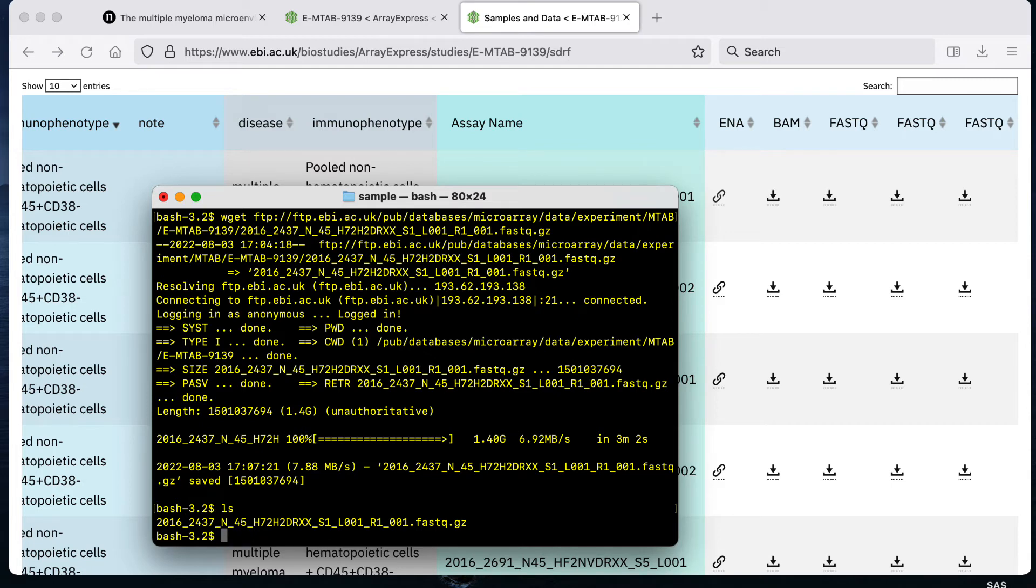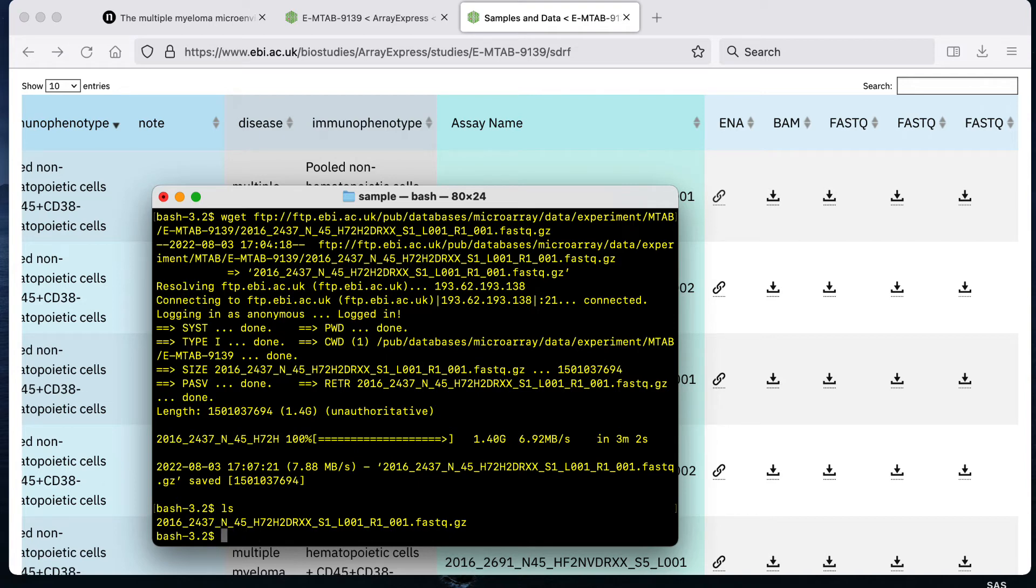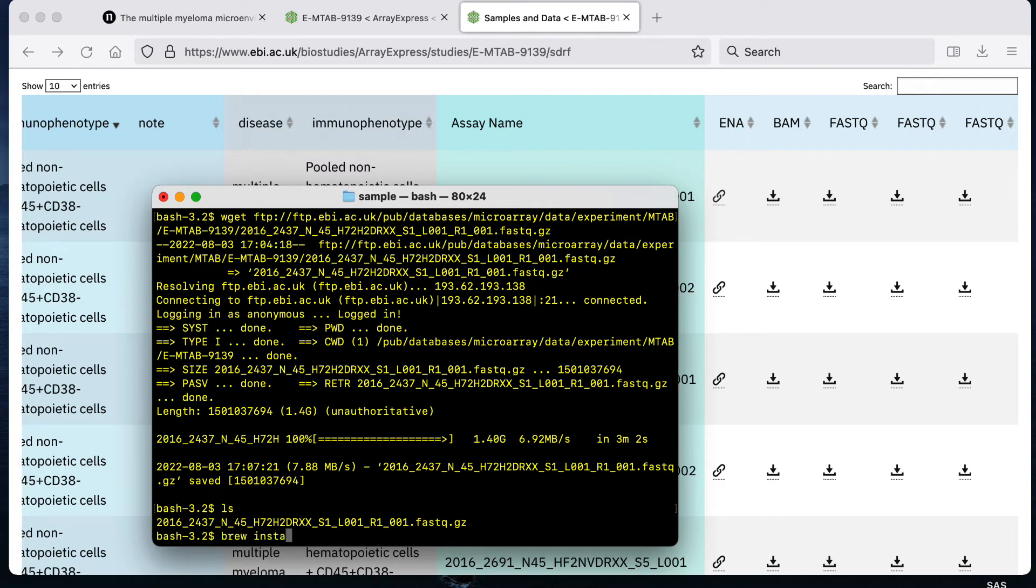If for some reason you have to do this type of download on a Mac, the Mac does not come with wget command automatically. There are two options. You can get wget like I already did which would be possibly through homebrew. You would download something called homebrew and then once you have that you would do brew install wget to get the wget command on a Mac.